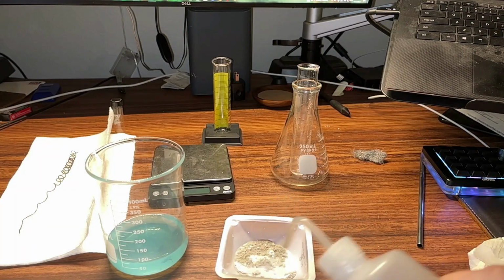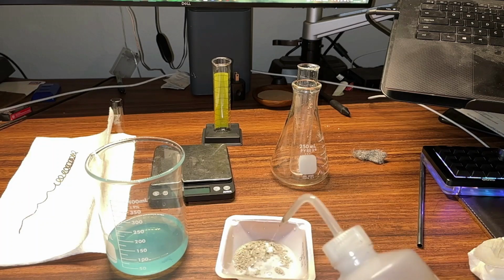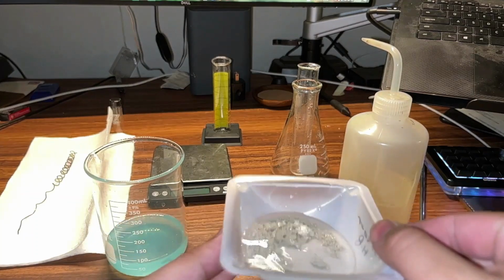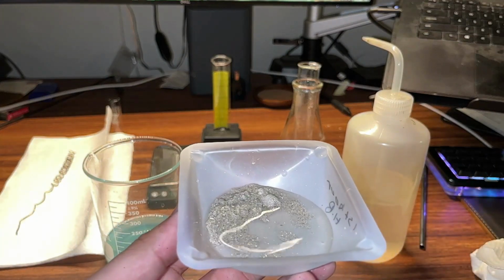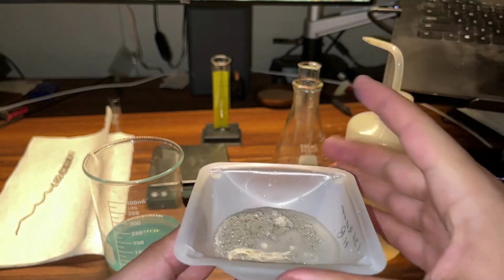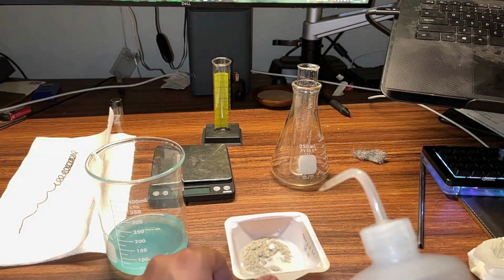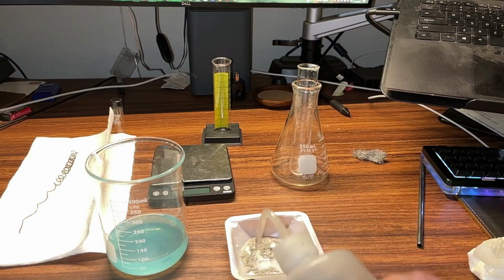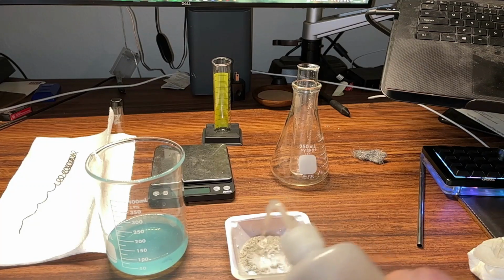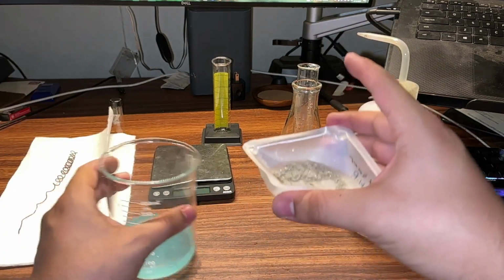But there's also a chance that each time I rinse, I'm losing a little bit of silver, because the silver stays floating in the, maybe you can see that. There's tiny little flakes of silver floating around that aren't really ever going to settle just because they're too light. So if I rinse over and over and over again, my product will get purer and purer, but I'll get less and less of it over time because I'll lose it to my rinsing.